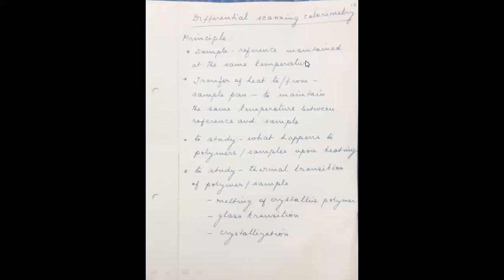But crystalline substances, as they have a regular pattern of arrangement, the bonding between every molecule is similar. All the bonds break at a particular temperature, so the melting is very sharp. Such melting of a crystalline polymer can be followed using this differential scanning calorimetry.